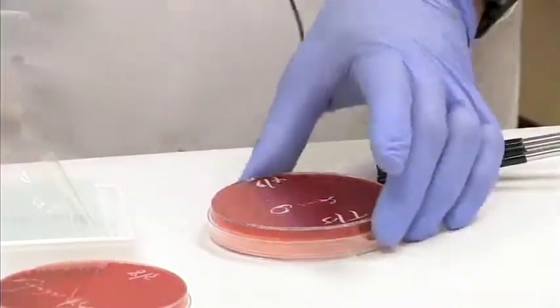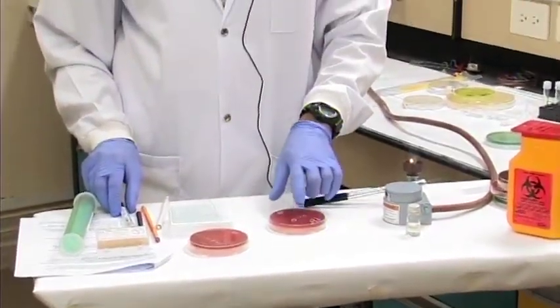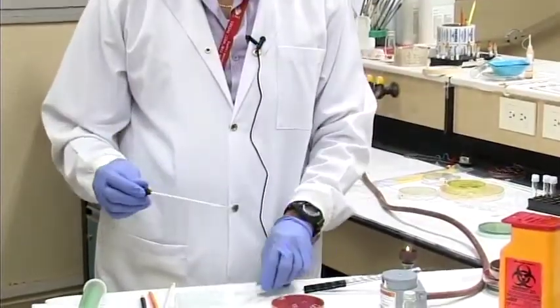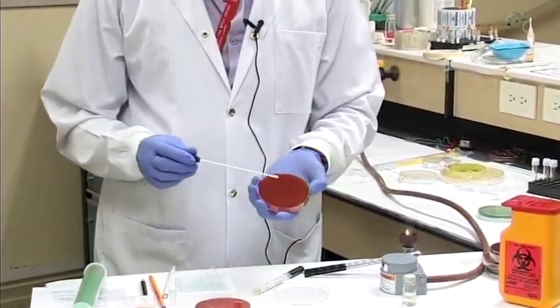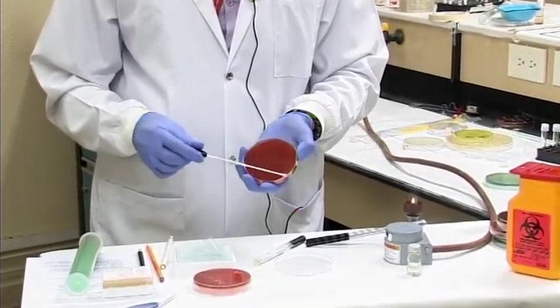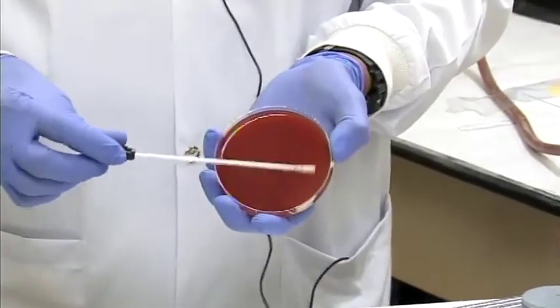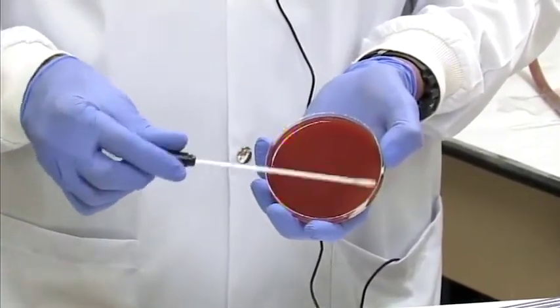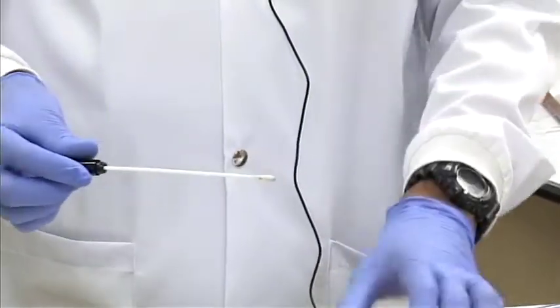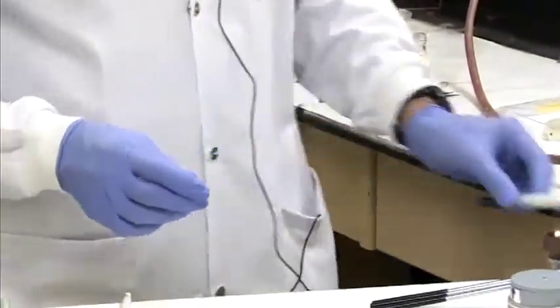Right. Once the plate is labeled, and you must label your plate before you actually place the specimen, then we'll take our sample, in this case our throat swab, and we're going to make a pool or inoculum into a small portion of the plate. So we will turn the swab, rotate the swab while making that circular inoculum on the plate. A small, very small portion. Place back the swab into its container.